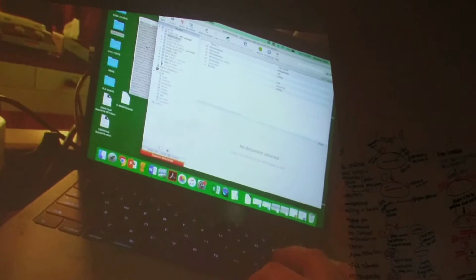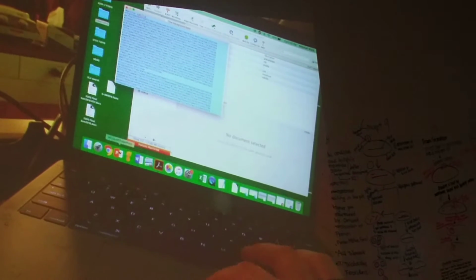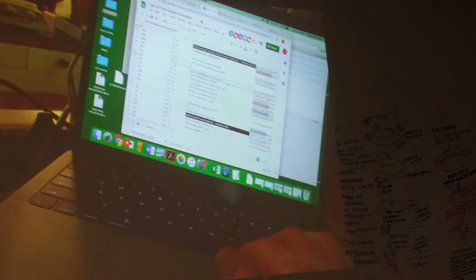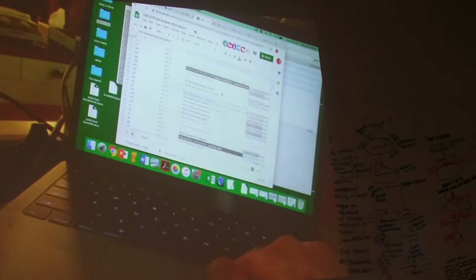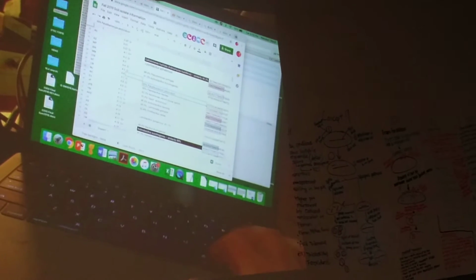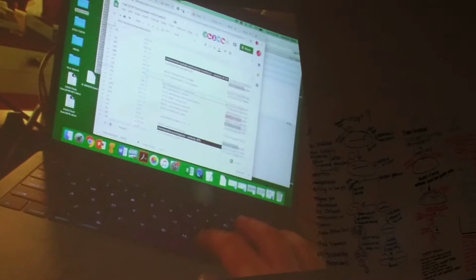I'm going to go to my sequence that I got from Dr. Becca. I can't choose any of y'all's sequences because then I'd be doing it for you. You can just blank it out and choose one. That way you don't know whose it is.